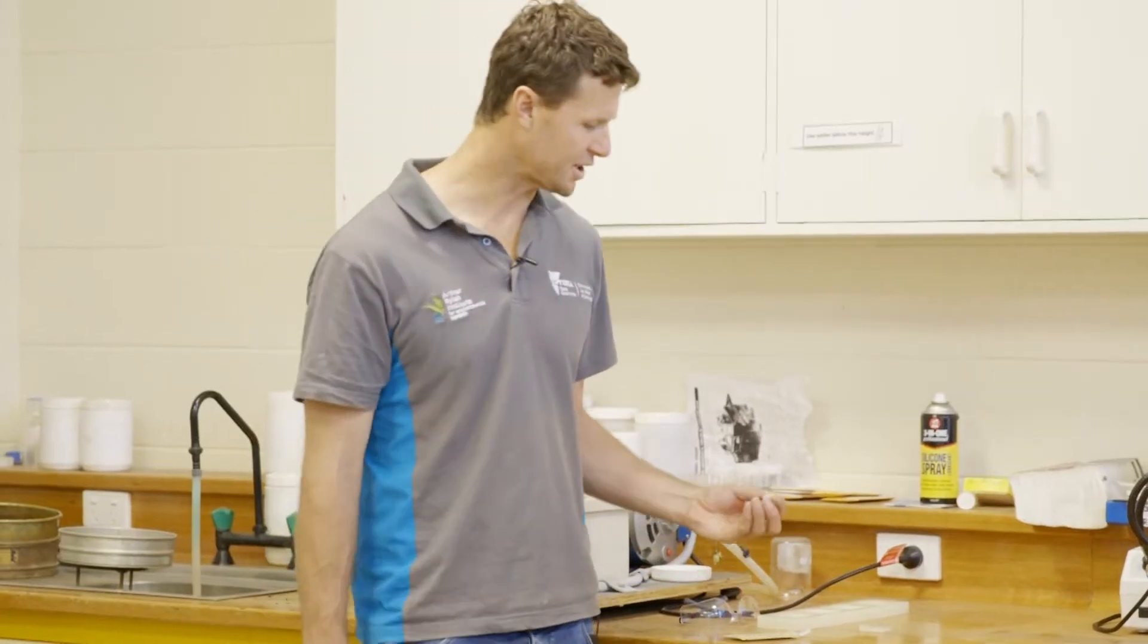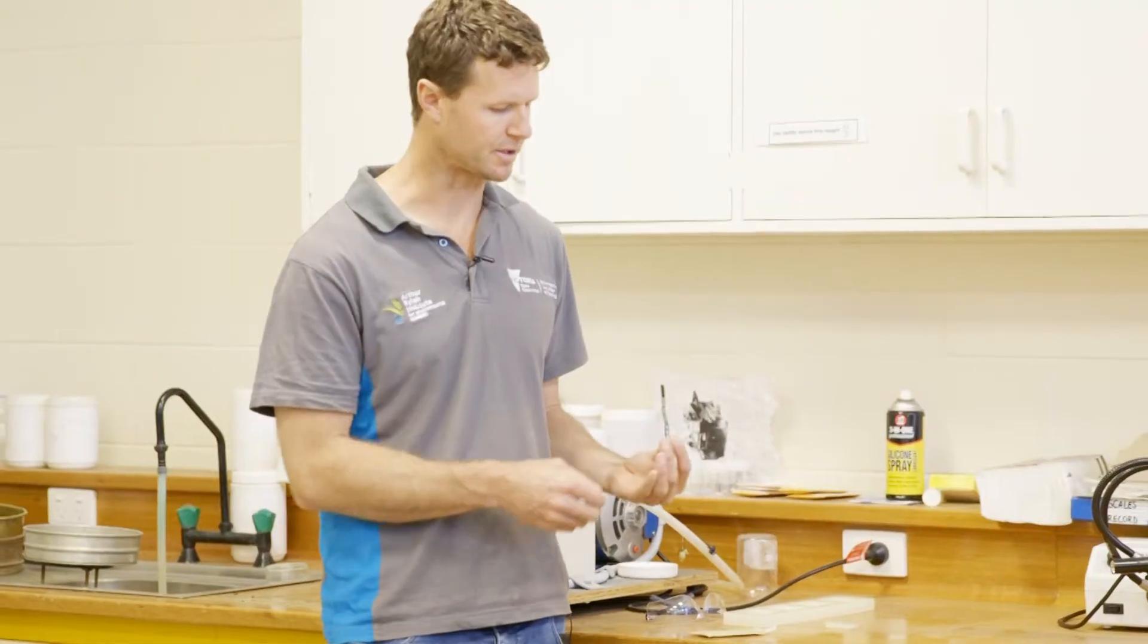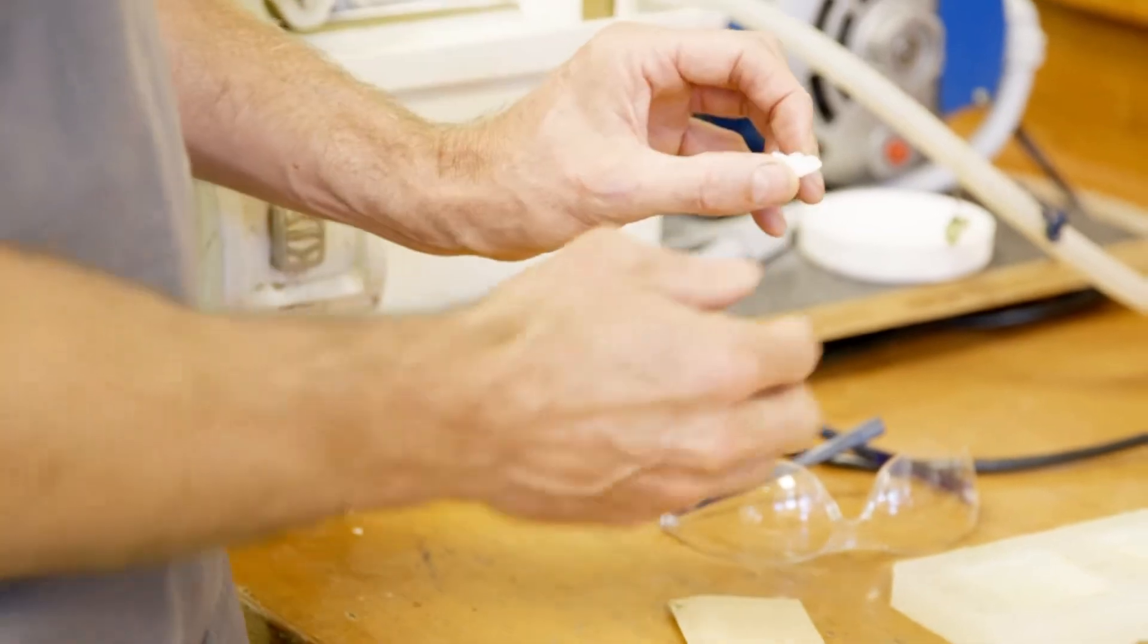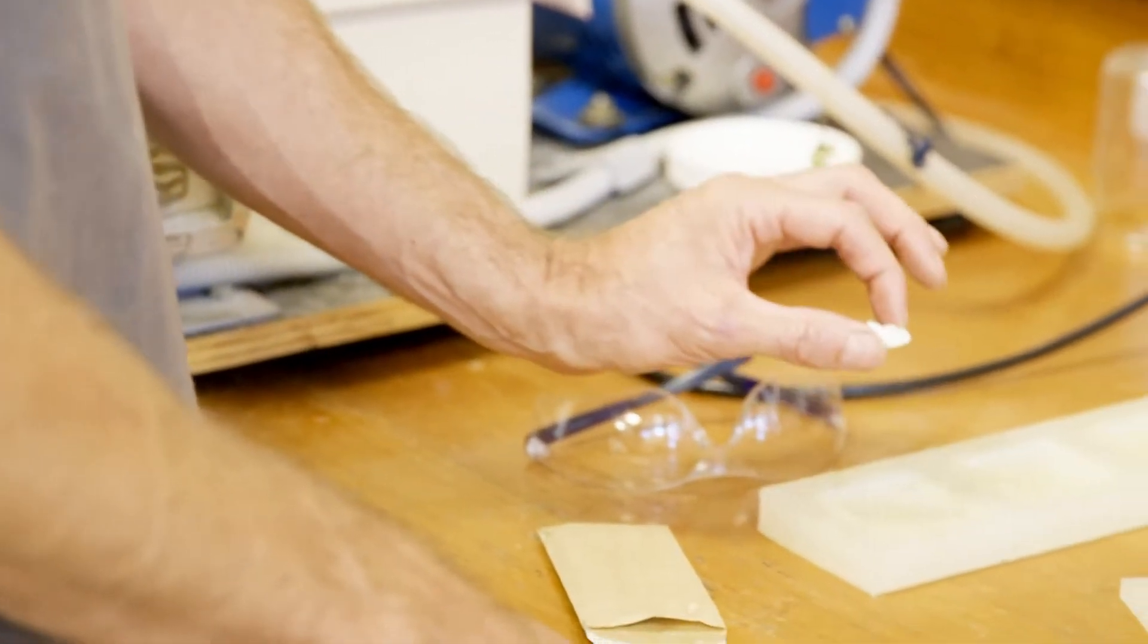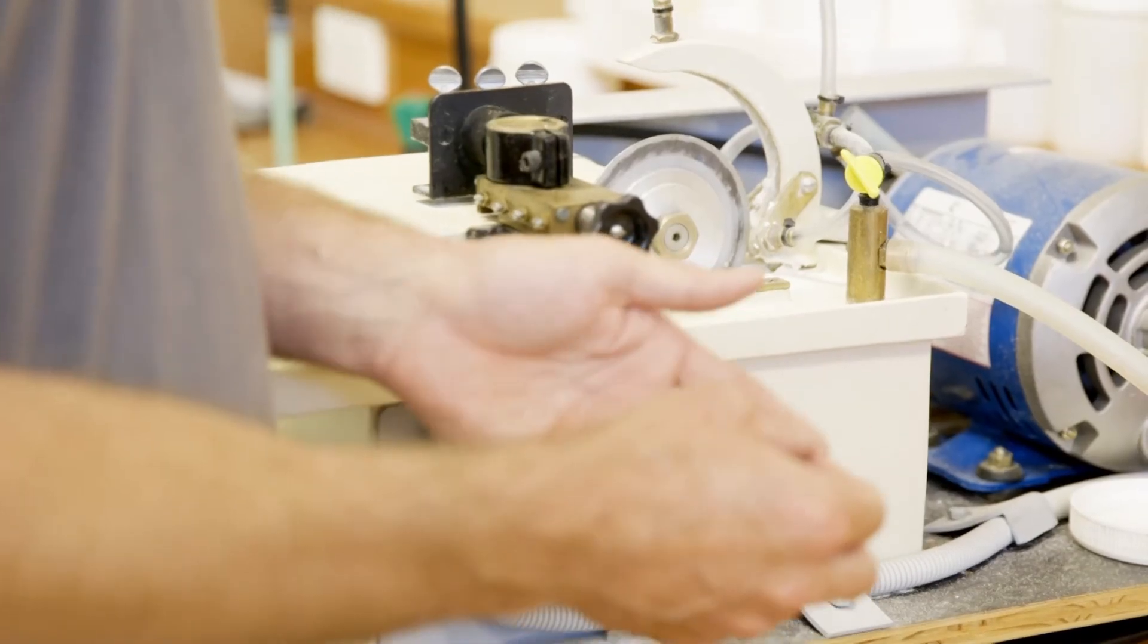When otoliths are brought back here to the lab we need to section them so we can get all our measurements out of them. For otoliths this size we take what's called a transverse section, so I cut across it. To do that we mount the otolith in resin, it sets hard, and then we take a cut using this gem master saw and we take a transverse section that's less than a tenth of a millimeter.